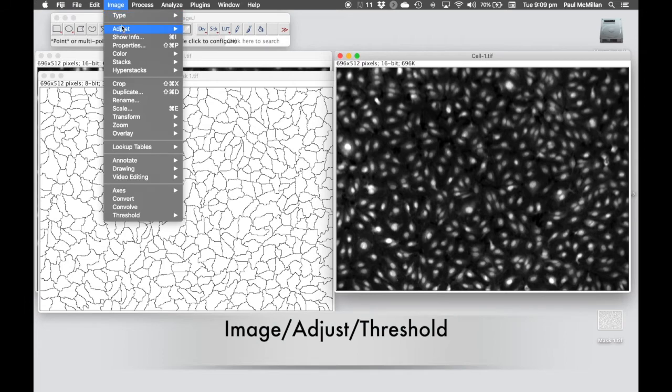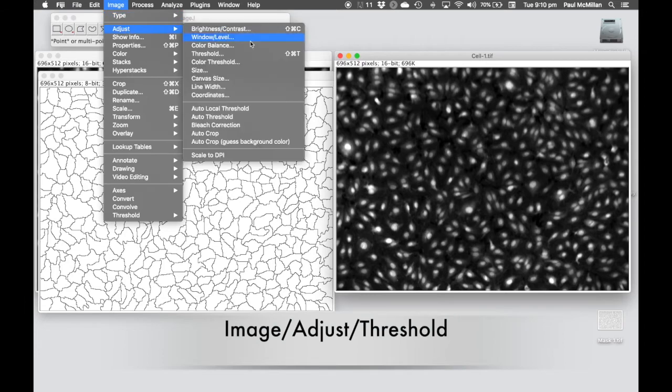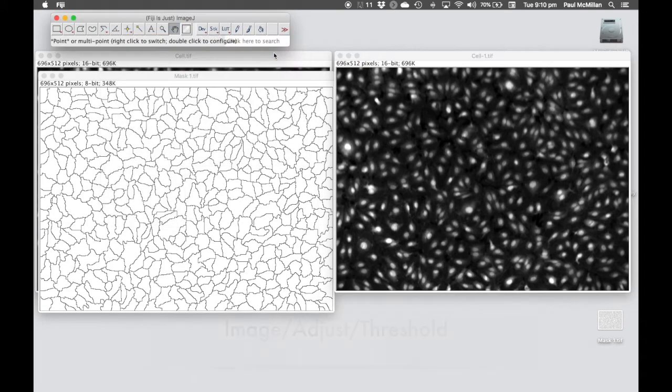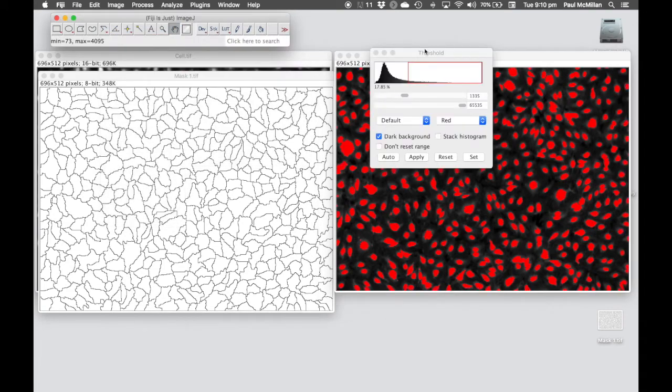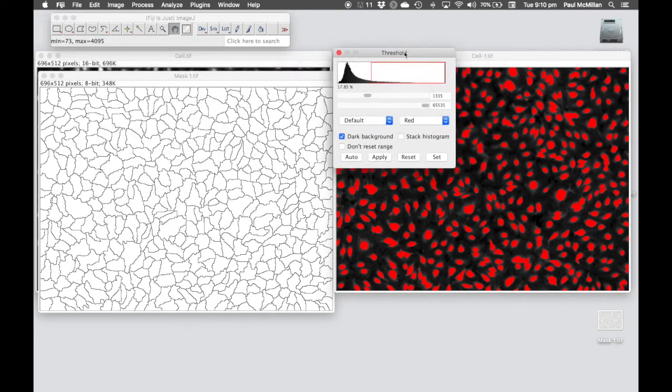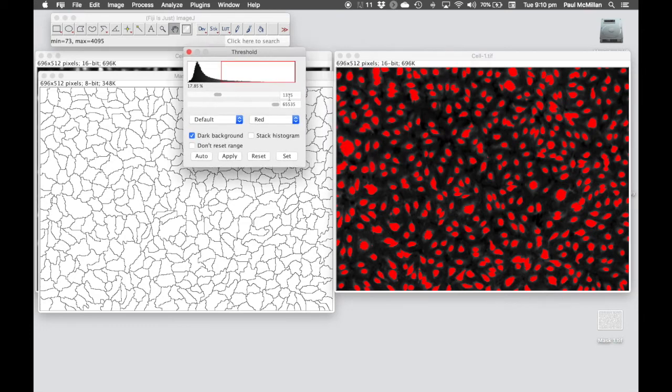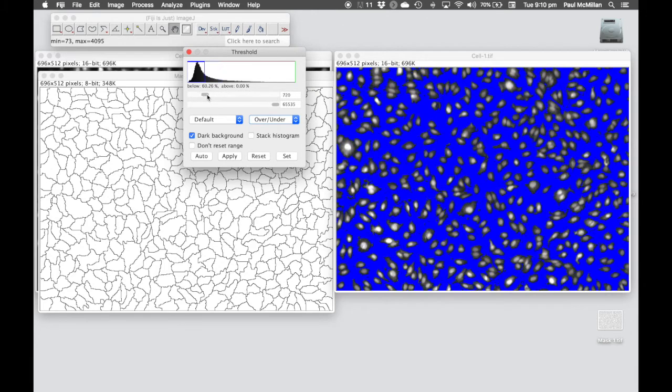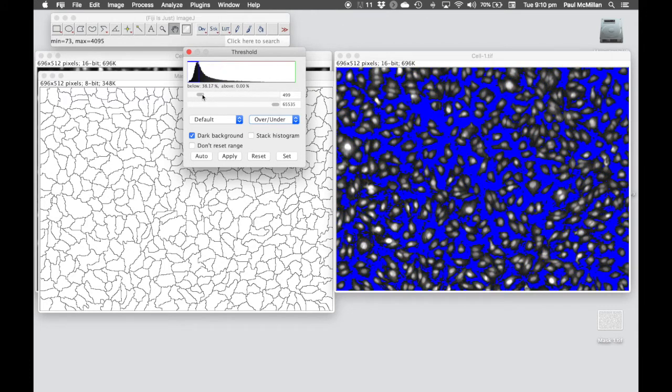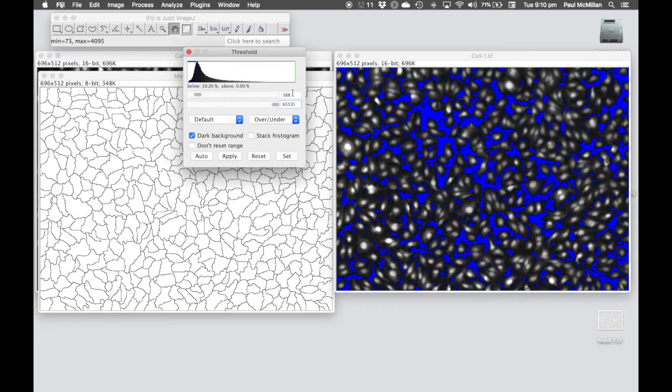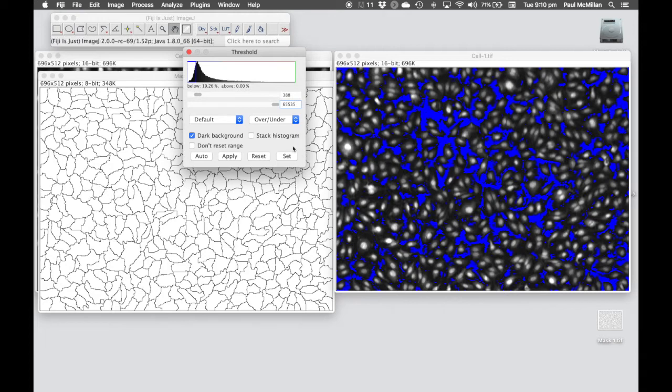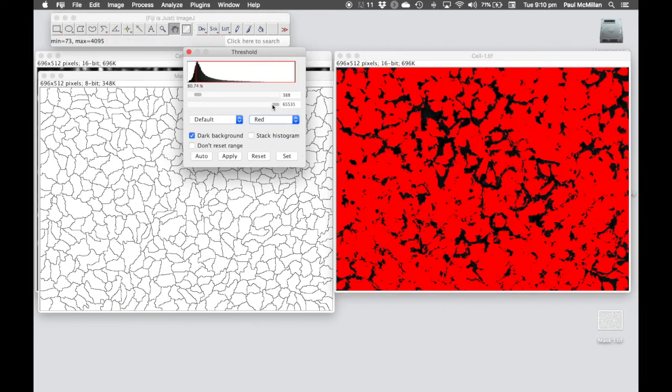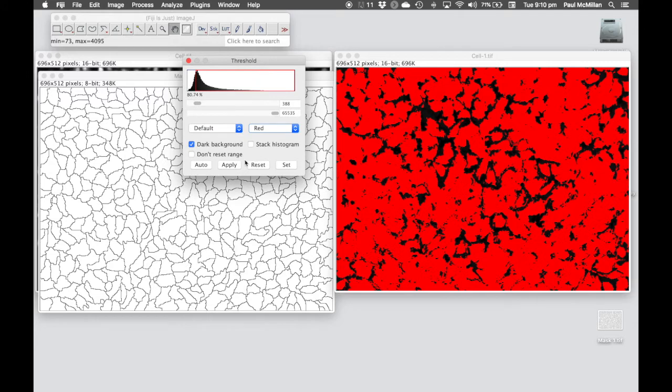Image, adjust threshold. Again, you can use the over and under for this if you want. The magic number I've got written in the instructions is 388, which looks something like this. We're highlighting where the cells are and not trying to highlight the background.